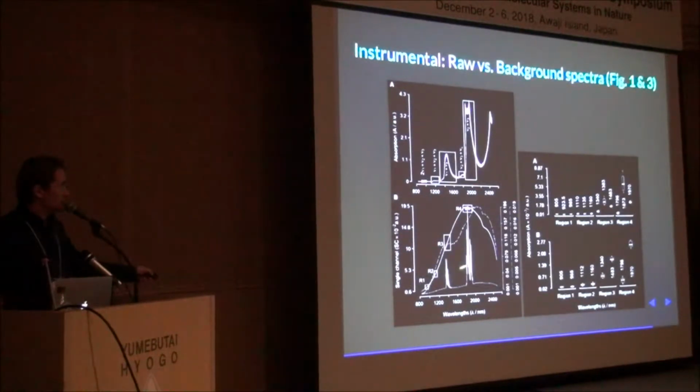So there is this tendency with longer wavelengths that variation, this is not the spectrum, this is variation. So there is more baseline shifting at longer wavelengths, and that trend decreases here. So there is a significant variation, but how much? Here I've taken this box plot of each of these regions, and this is the scale 10 to the minus third. So with shorter wavelengths, you don't get a lot of variation, absolutely speaking.